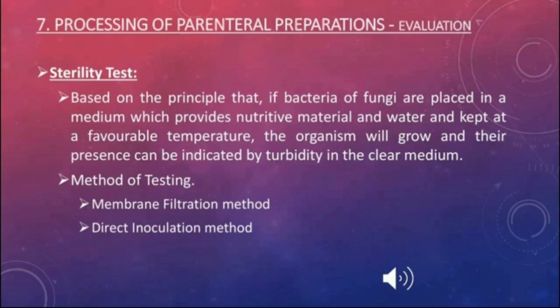If there is evidence of microbial growth, isolate and identify the organism. If they are not readily distinguishable from those growing in the containers reserved in the first test, the preparation being examined fails the test for sterility.